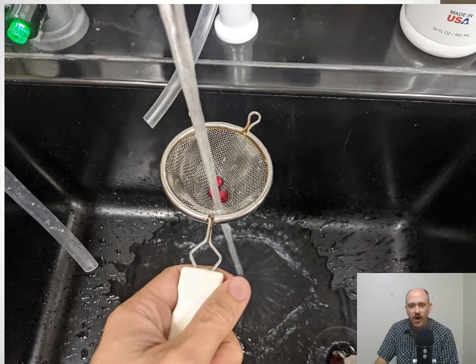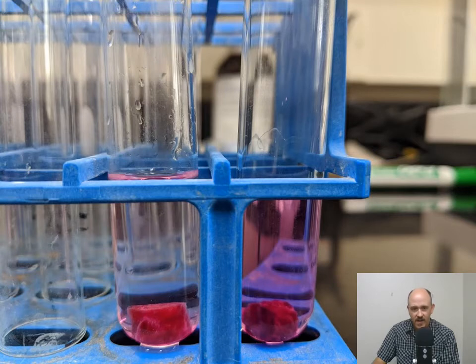We want to measure alcohol-induced damage, right? So we rinse off the beet, and then we place it in various concentrations of ethanol. So you would make dilutions of alcohol, and you would put the beets in there for 5 minutes, and then you would take the alcohol out with a pipette and see what its absorbance was using a spectrophotometer. So here we can see in this test tube on the left is water. It's just a very light pink, and over here is 95% ethanol, which you can see is much pinker, but that's qualitative data.